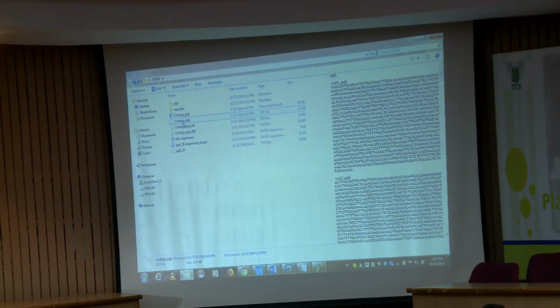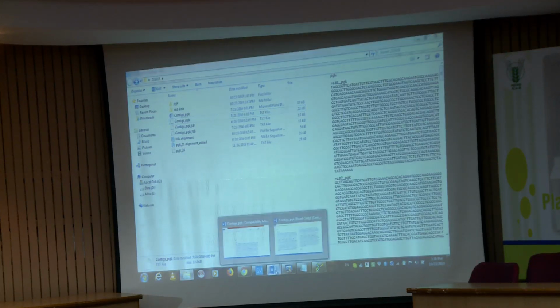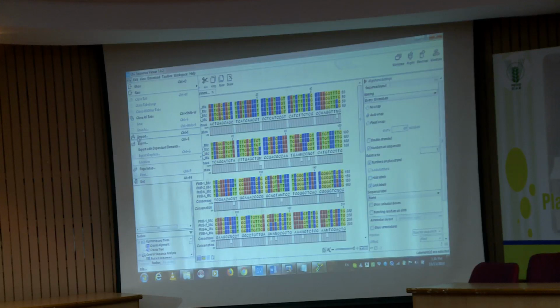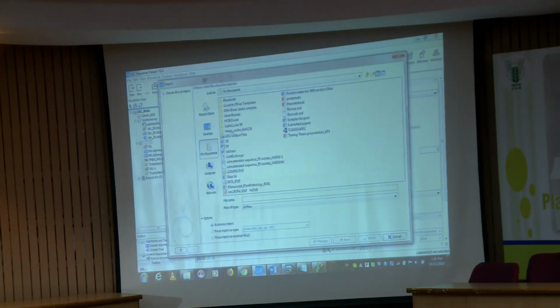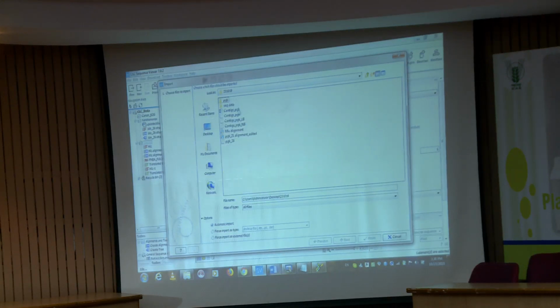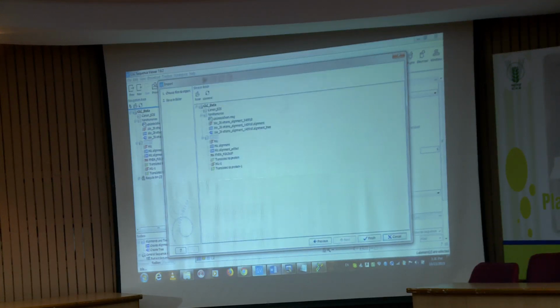So, what I will do is make the contig from the raw sequences, make one Word file, convert it to a text file, and import it in this software. Now I'll show you how to import it. Here one option is there: File, Import. Then I'll pick the file which I already made, next, next.